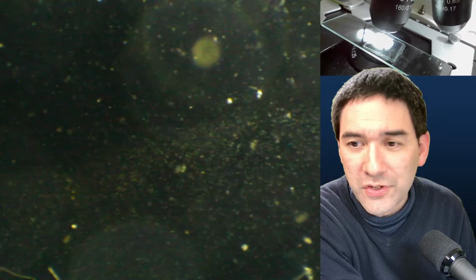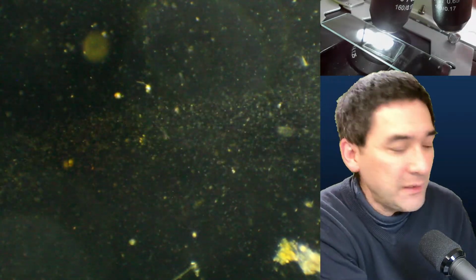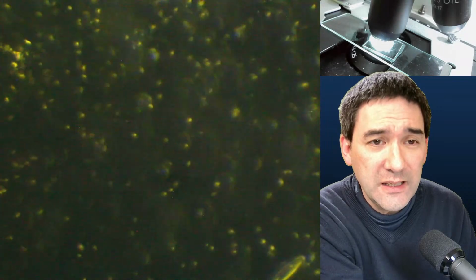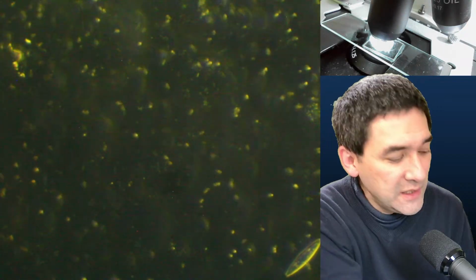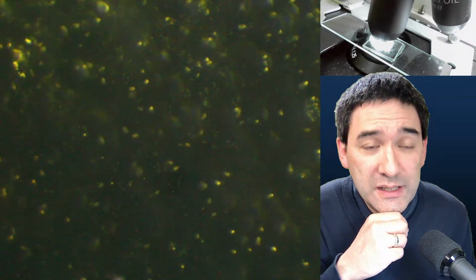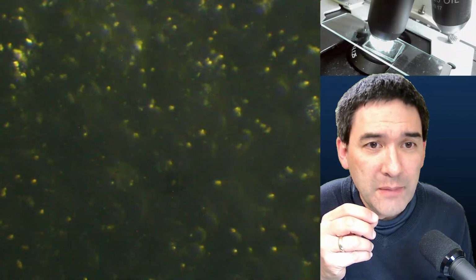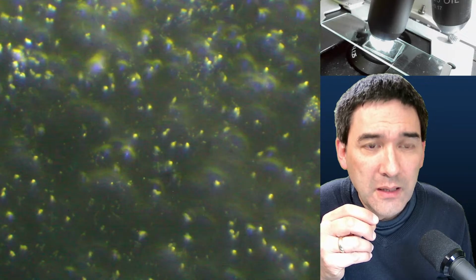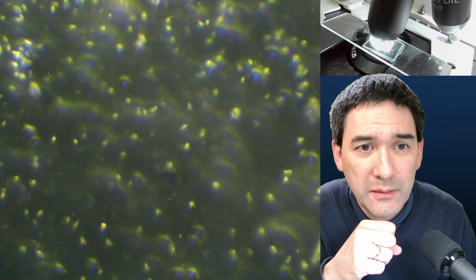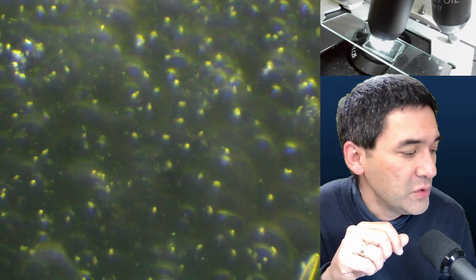Can you go to higher magnification in dark field? Yes, but I'm not quite sure whether the filter is the correct size. Higher magnification dark field still works. You see, the thing is the image quality really drops. The reason is that at a higher magnification there is much less light, and then the camera has to expose more. It has a higher gain, and then it becomes more and more fuzzy. That's now using the 40 times.